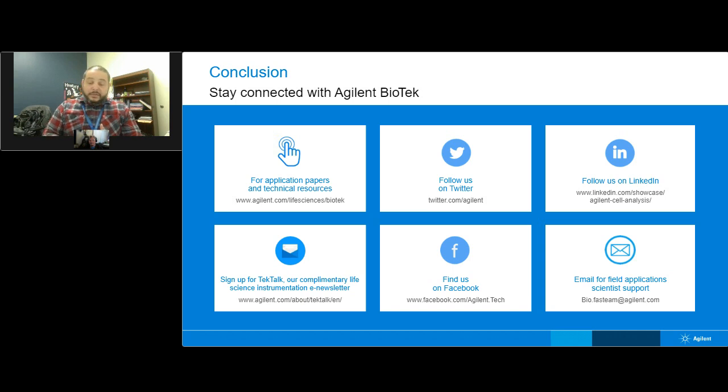That being said, because this is an automated system, there's a lot of checks in place to make sure that you avoid some of the dangers with a manual microscope setup, such as there are checks in place to prevent you from crashing your objective into your actual sample. So as you're toggling through, you physically can't go beyond the working distance of your objective to prevent those kind of issues from damaging your objective.